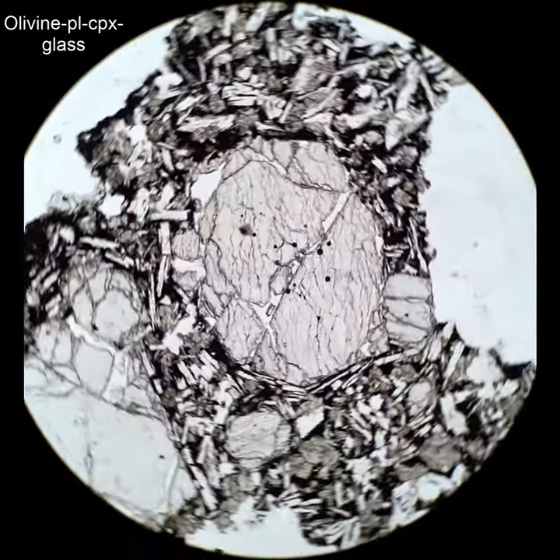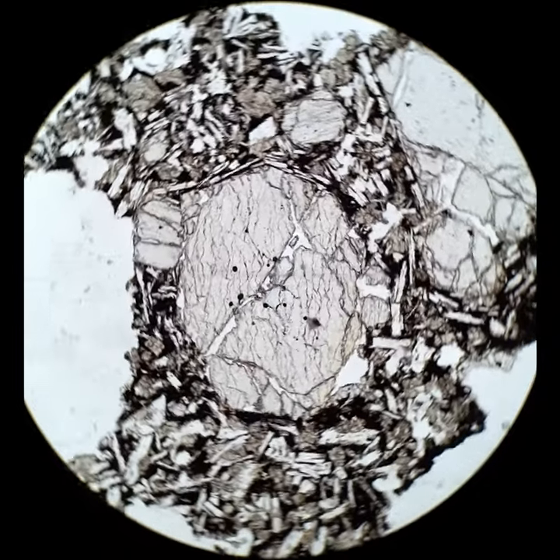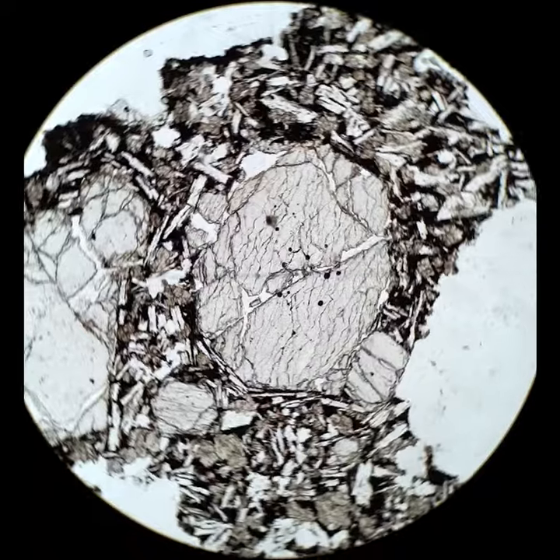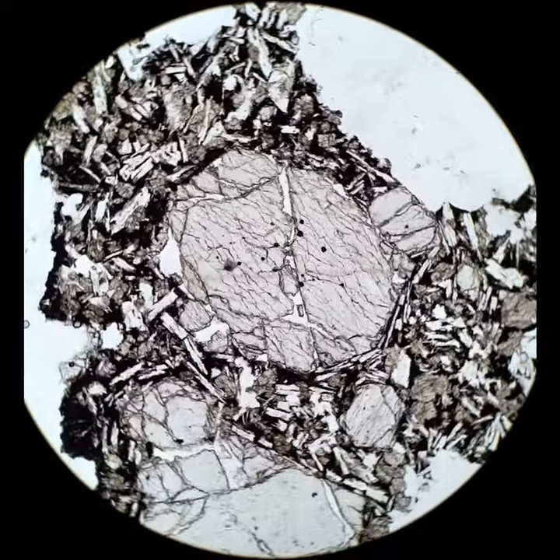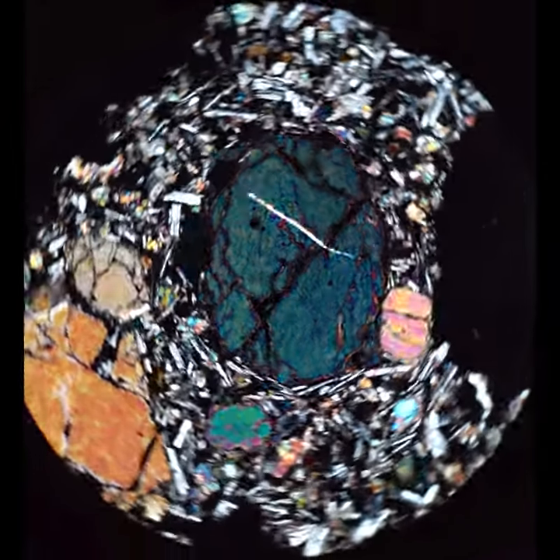And then one last olivine. This one shows some rather poorly formed cleavages. Cleavages are not super common in olivine, to see them in olivine. But they do form. And you can see them in some thin sections.